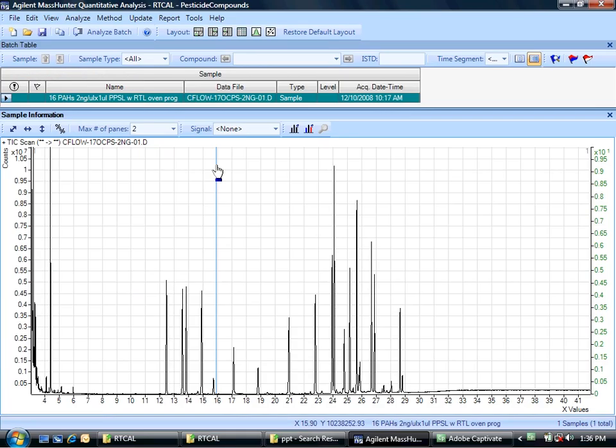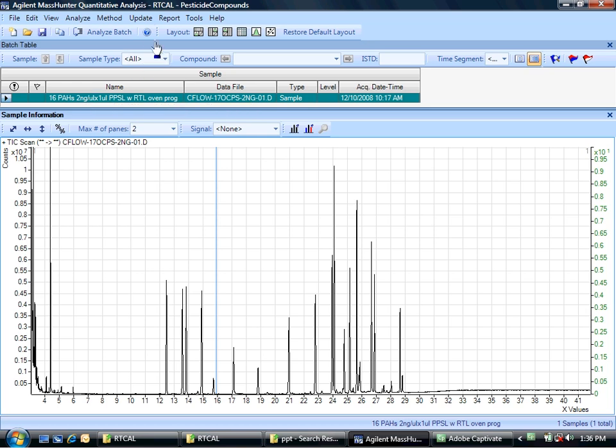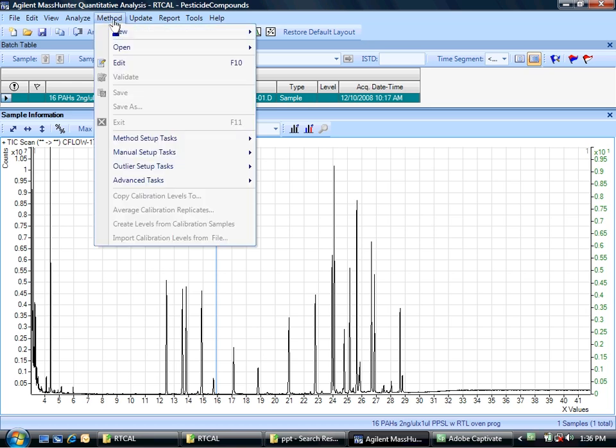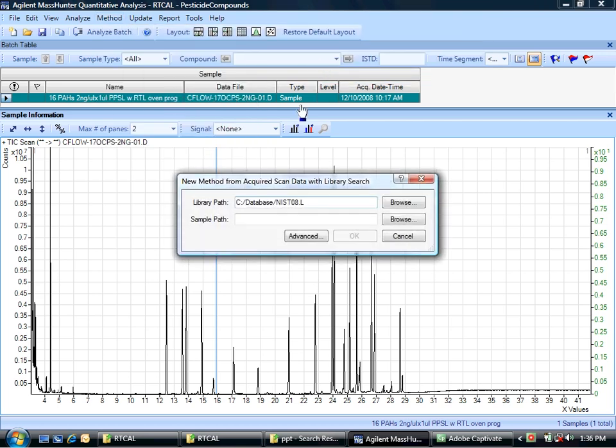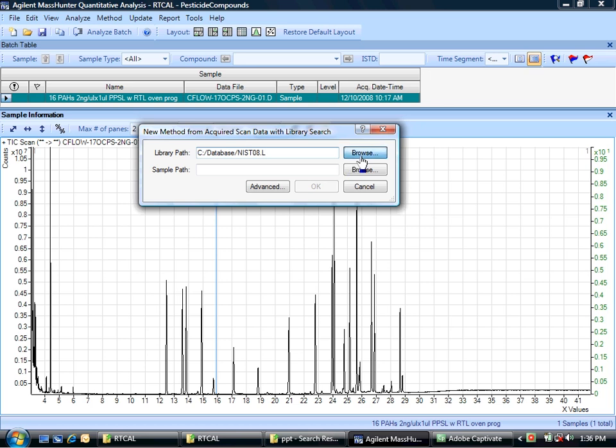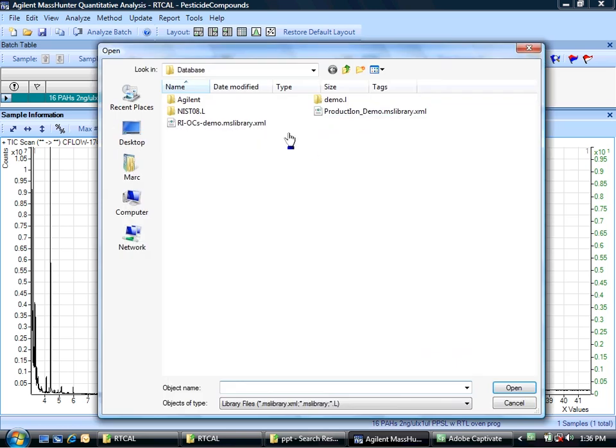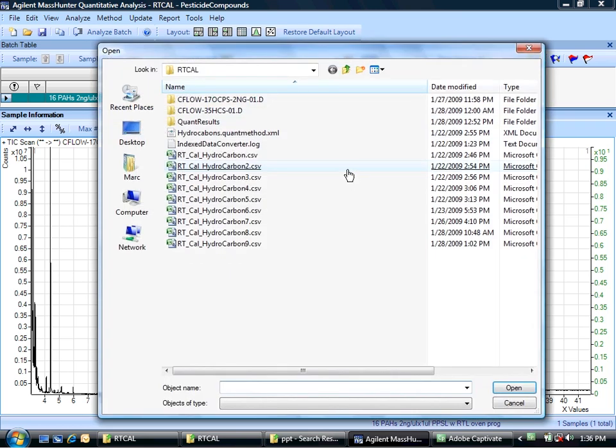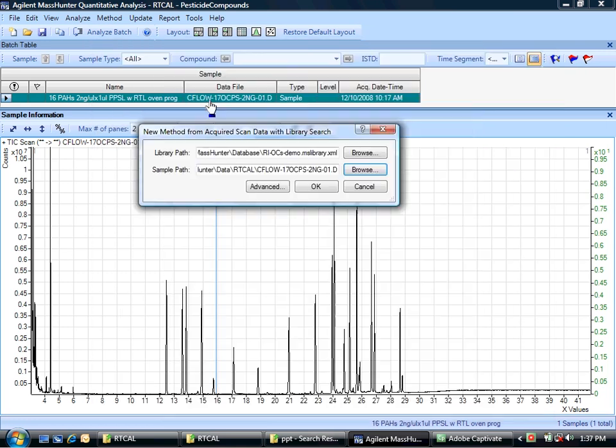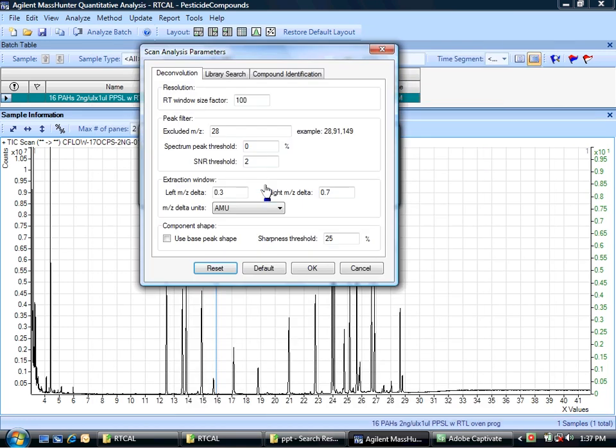Now it's time to really apply this technology. I've got a new injection that has, I believe, some pesticides in it, and I'm going to demonstrate this technology by using new method from acquired scan data with library search. So it will use the library search, look through and find compounds, and create me a quantitation method, very similar to the thinking behind unknowns analysis. So here I go. I'm going to point it to the library that I've got. I'm going to pick that file that has the pesticides in it.